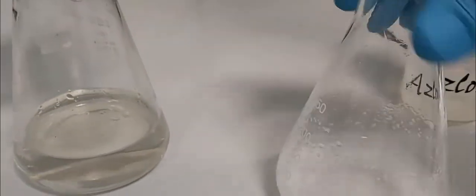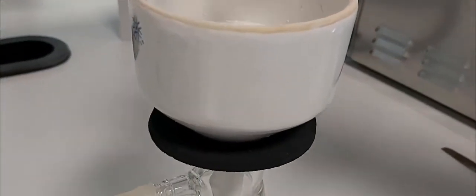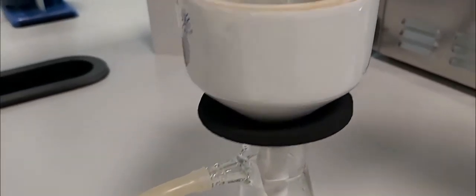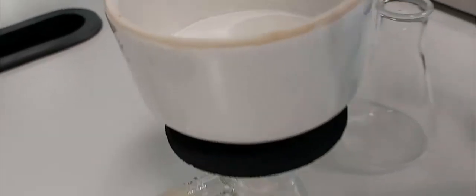I wash the solid again with cold water. We still have here our solid — a beautiful, colorless product, which is excellent. I wash it again with water to be sure, and then I take out the magnetic stir bar.